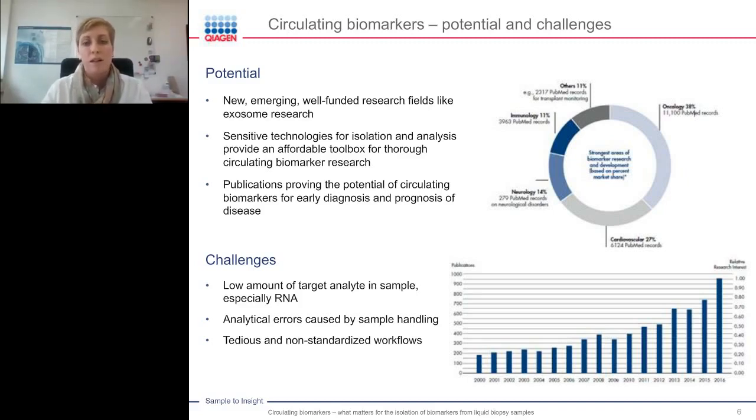This is also highlighted here by the lower right graph, which shows you the increase of publications from PubMed on the topic of liquid biopsy and circulating biomarkers. And as I already mentioned, we now already have the right toolbox in hand with sensitive assays like next-generation sequencing or digital PCR to really analyze these liquid biopsy samples and the circulating biomarkers within these samples in detail and understand the full potential of this new sample type.